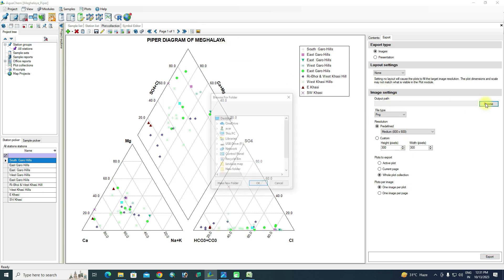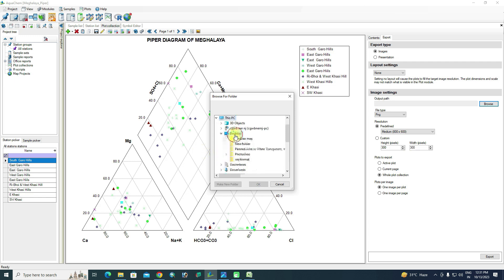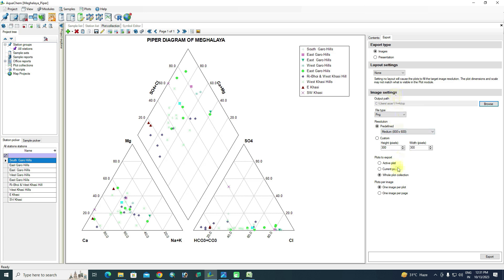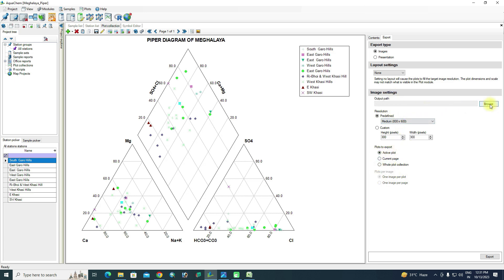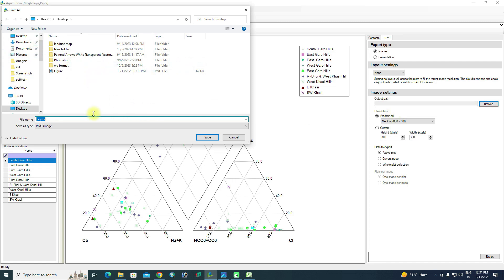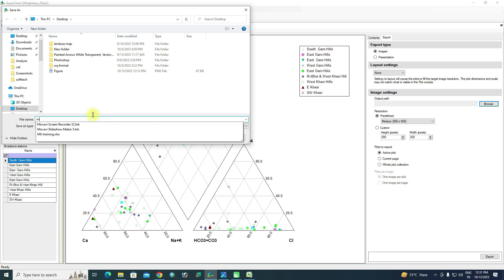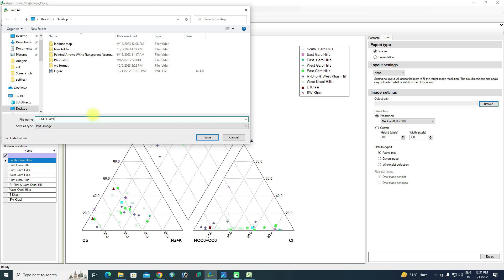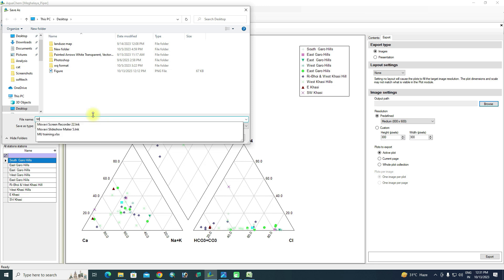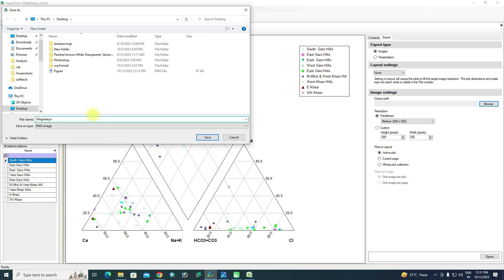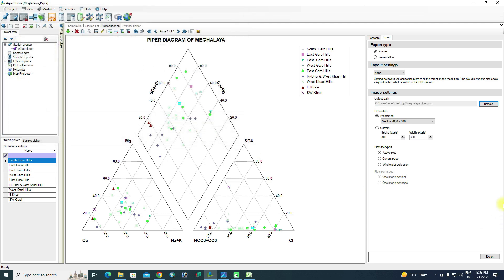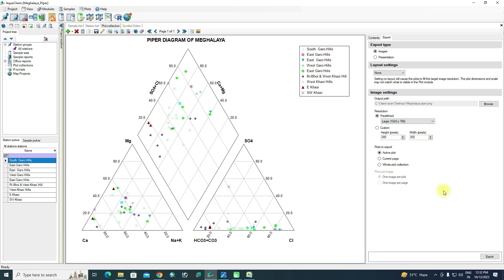To export the image, click the export button. Browse to choose the destination folder — I am saving to the desktop. Make sure to select 'Active Plot'. Browse again to the desktop and set the file name — I am naming it 'Meghalaya Piper'. You can select different formats; I am saving as PNG.